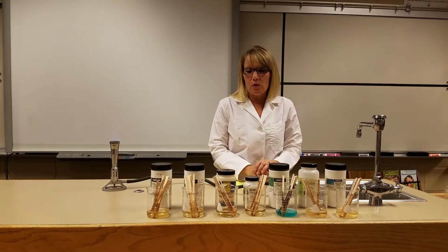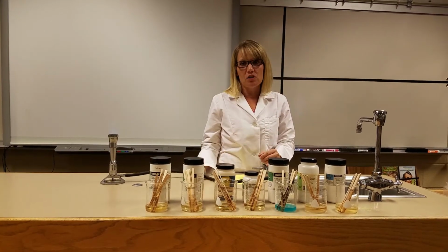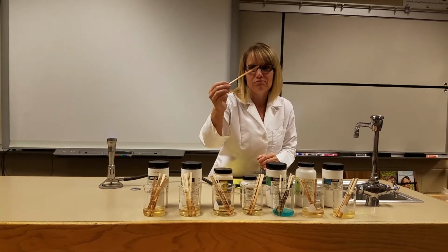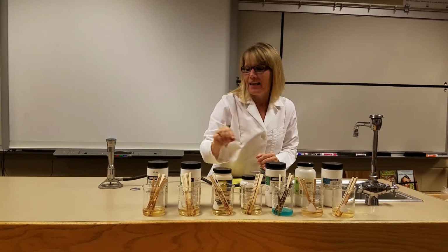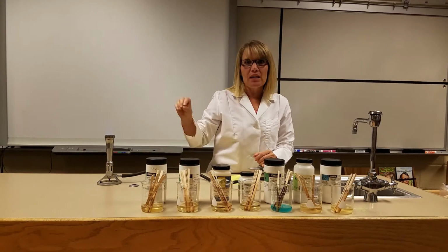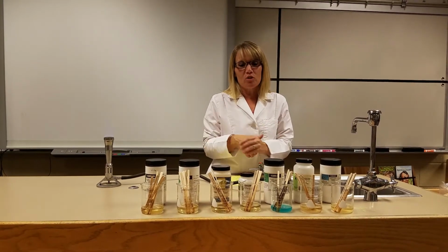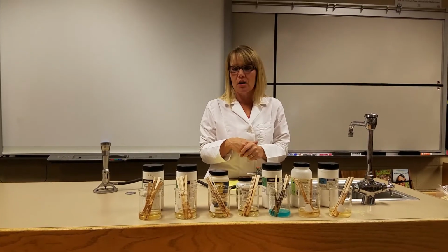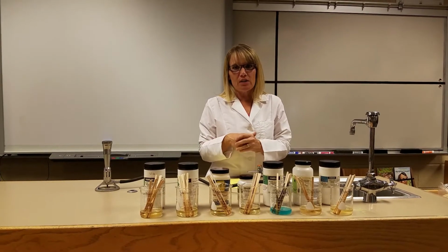But a cool thing that you can do with these different compounds is you can hold these little wooden sticks in the flame after they've been soaked, and the color of the flame will change depending on which element is mixed with chlorine in that particular salt. So I'm going to turn off the lights and we'll get started.